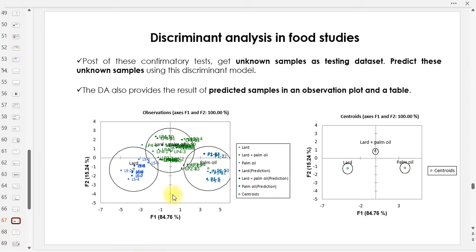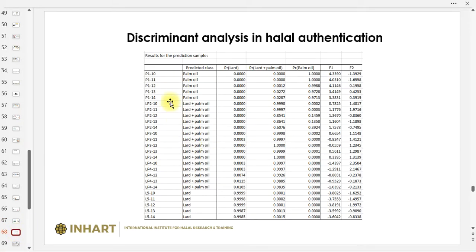If you look deeper at the middle one, there is a yellow circle with green color. That one we call the centroid. It will be represented with another plot, so they plot the centroids only. You can see there are three different groupings using the centroid plotting, just to show you. We have that significant grouping. So this is how a discriminant analysis result looks.